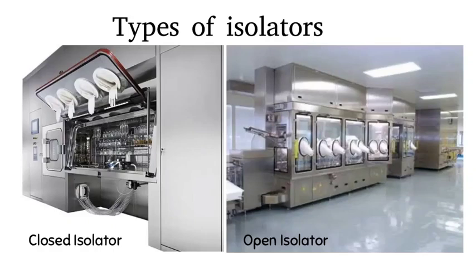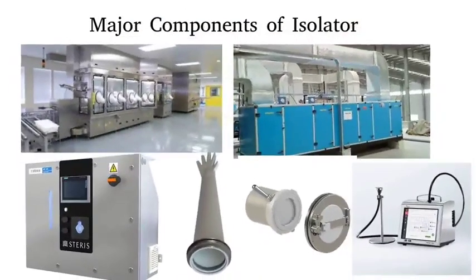Closed isolators do not exchange unfiltered air or contaminants, or any material flow with adjacent environments. Examples are sterility testing isolators and cell gene therapy isolators. Open isolators are designed to allow the continuous or semi-continuous ingress and/or egress of materials during operation. Examples are isolators used to fill vials, PFS, and cartridges. Let's talk about open isolator systems in this video.